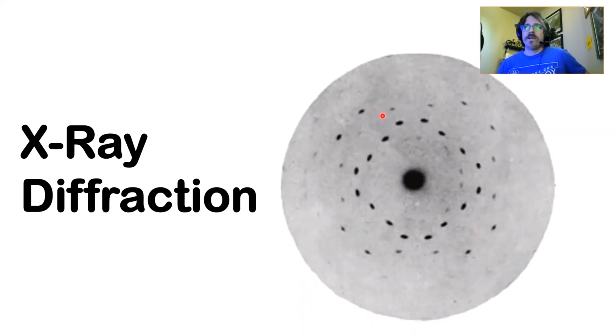And these spots are patterns, and depending on the crystal structure and the orientation of your crystal, you will have a different pattern. Learning how to interpret these orientations becomes a good art. We'll talk a lot more about pattern-based diffractometry when we talk about transmission electron microscopy. But I wanted to show you that the earlier forms of X-ray diffraction were exclusively pattern-based. Our society didn't have the technology to create a spectra from an incoming photon beam.